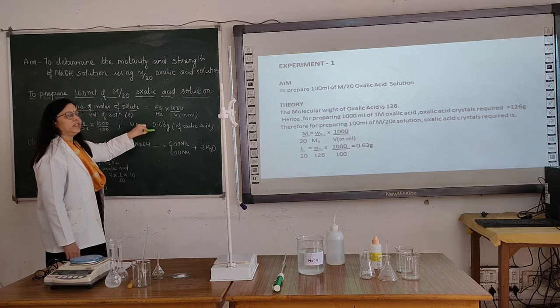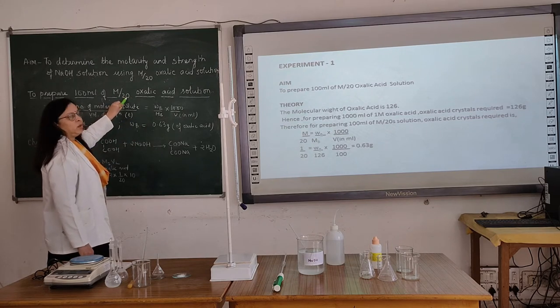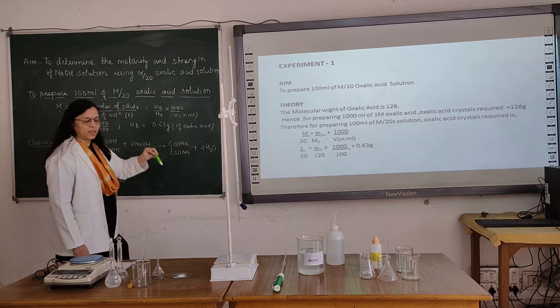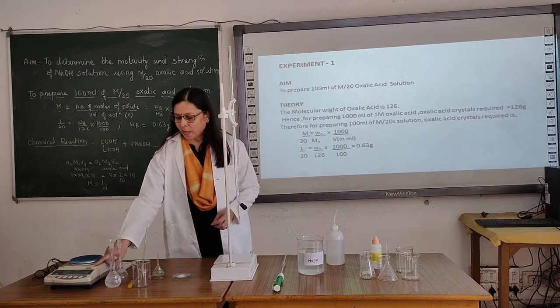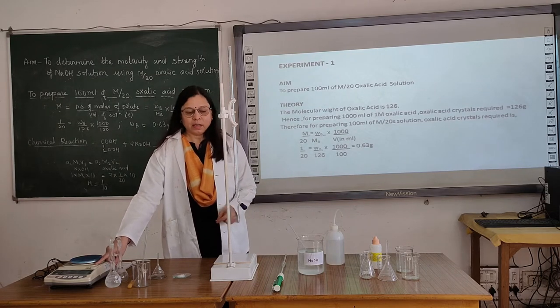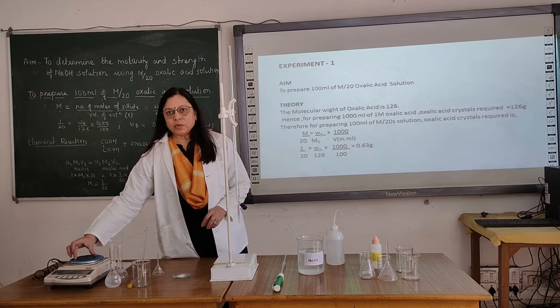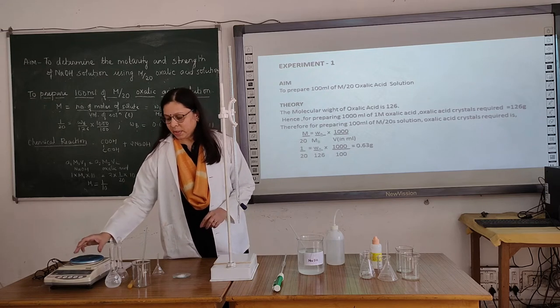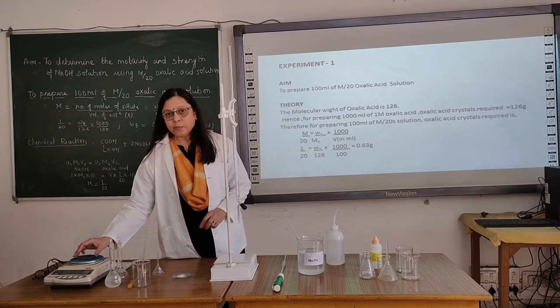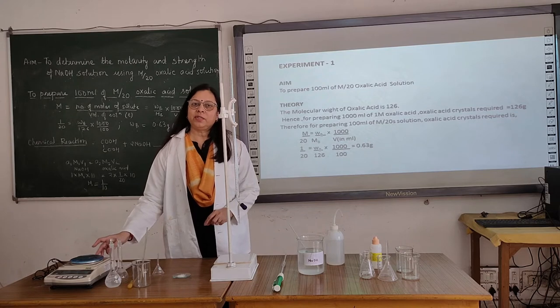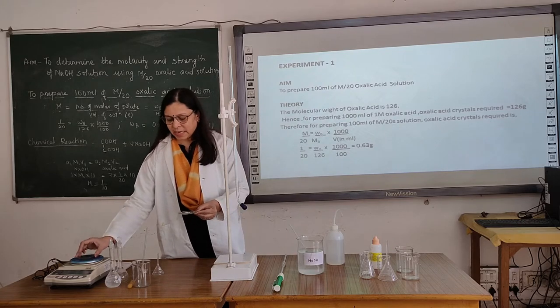This much amount of oxalic acid is to be weighed for the preparation of N/20 oxalic acid solution. Now let's perform this experiment. This is an electronic balance, and using this electronic balance we will take the weight. First of all we will place the watch glass on this electronic balance and note the initial reading. Then we will add oxalic acid and make up accurately 0.63 grams of oxalic acid. I have already prepared this 0.63 grams of oxalic acid.